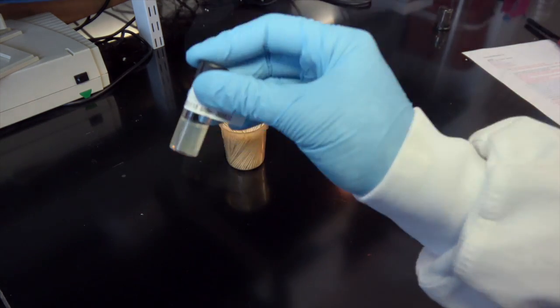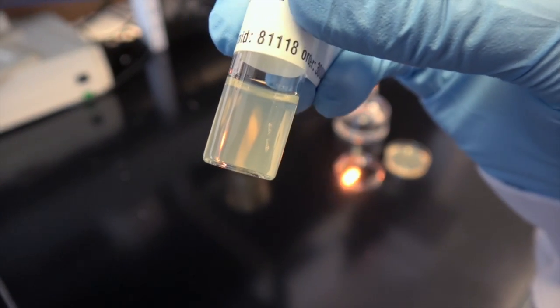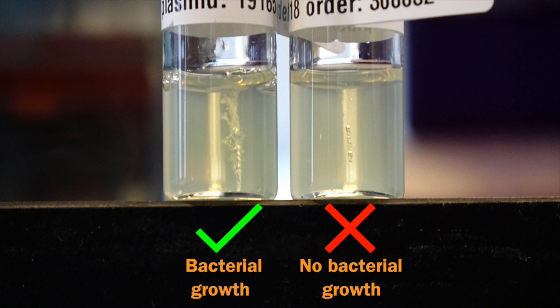Next, we take a look at our stab to make sure that there is visible bacterial growth. If nothing has grown in the stab, it's unlikely that anything will grow on the plate.